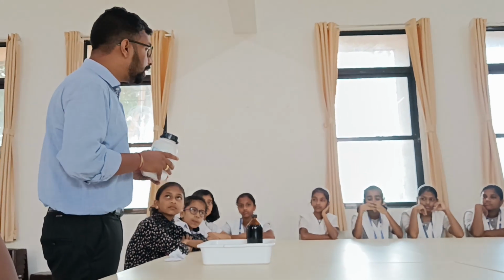Now today we are going to test the presence of starch in a food material. For this we have certain food materials that we have brought, and we also have some starch with us. So what are we going to do? We are going to take this starch in a petri dish and put a drop of iodine on it and check whether the color of the iodine changes or not. Understood? Yes. Let us see.